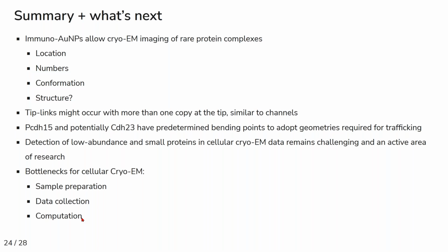But in the future, we need better approaches to automatically annotate molecules. And one very exciting development right now is machine learning computer vision approaches that seem to be very adept at finding molecules in cryo-EM data.